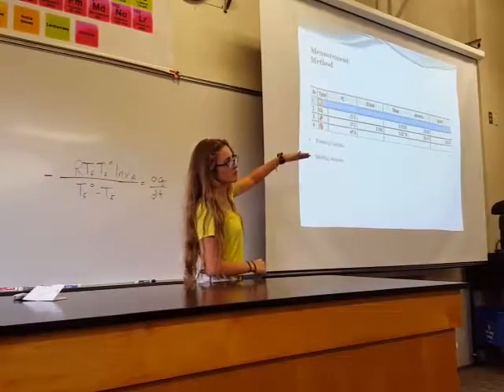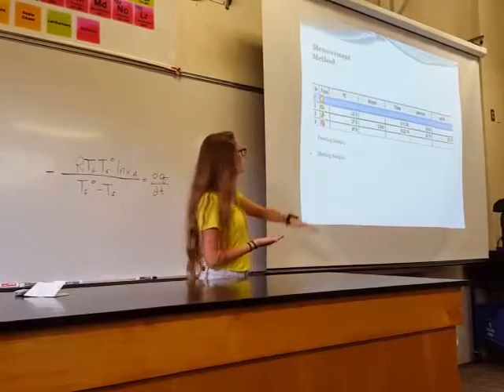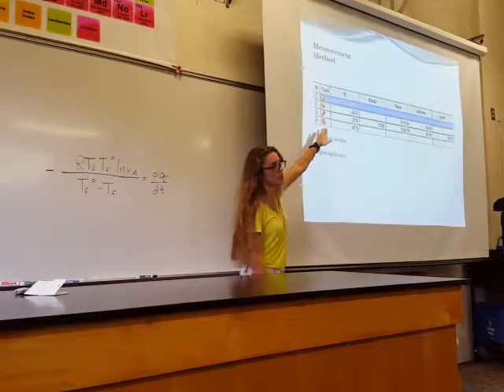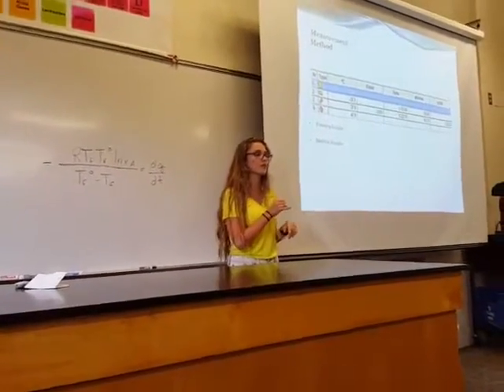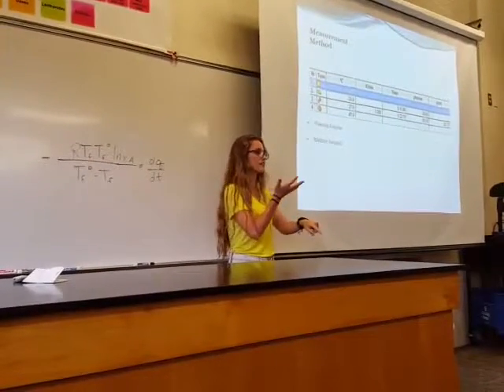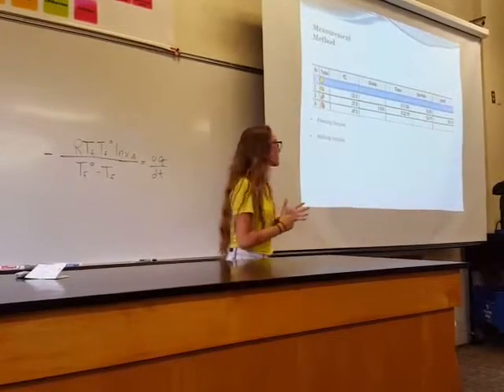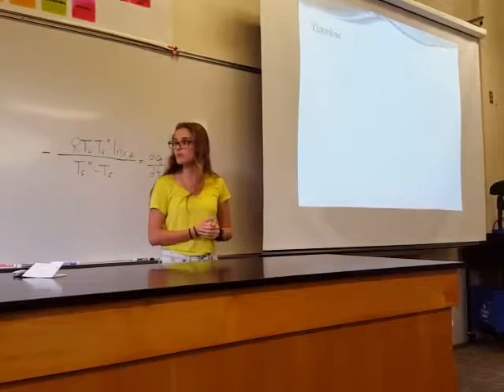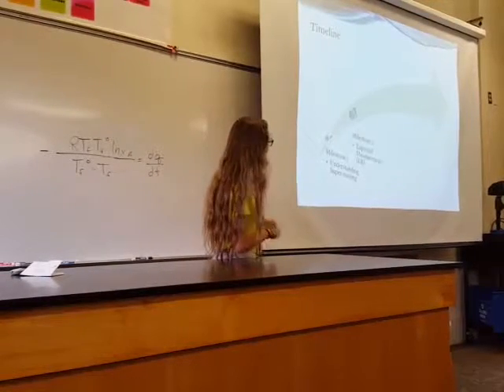And so for our bacterial samples, what we decided to do was start at negative 30 degrees with a 15-minute isotherm, and then increase the rate to 37 degrees at 3 kelvins per minute, which was the fastest and most precise. We also did a 20 microliter sample to prevent that variance in the incline of the curve. Okay, perfect. So we figured that out.